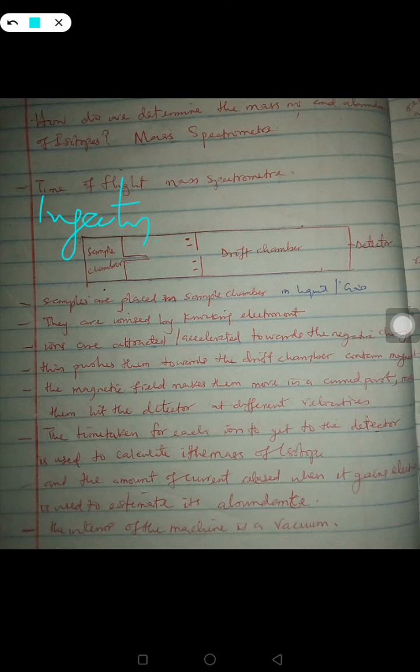Now, the sample you're adding must be in liquid phase or gaseous phase. It's very important. The sample cannot be solid, so it has to be in liquid or gaseous phase so that electrons can be easily knocked off. If it were solid, it would be turned into powder, liquid form or gas.